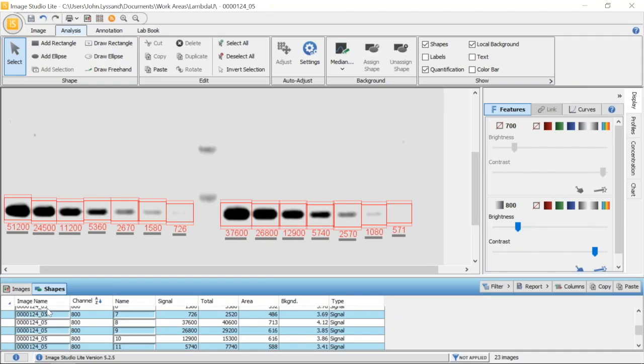We have the image name, the channel the quantified region sits in, the name of the shape, and our background corrected signal. The total area and background values listed are what are used to drive the signal value. The total value is the summation of all pixel values within the region of interest from the original file.